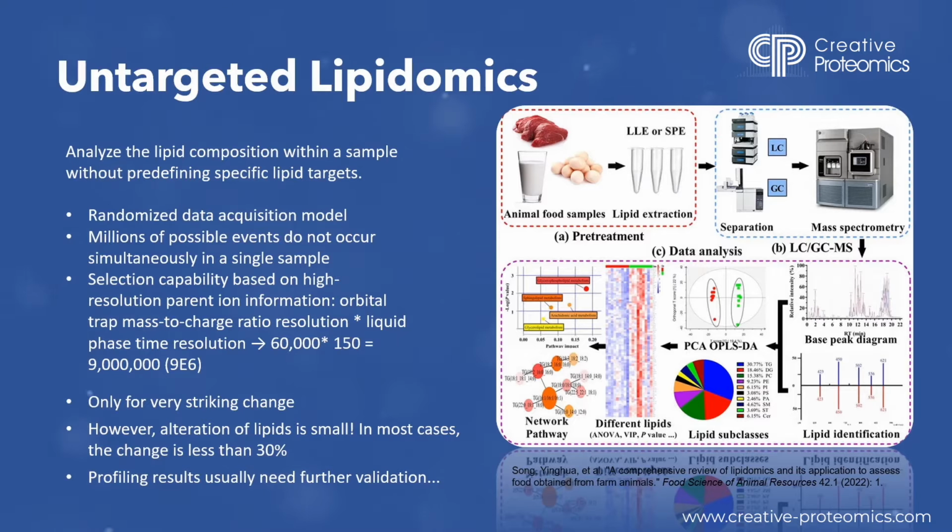Untargeted lipidomics analysis is particularly useful in discovering novel lipid biomarkers, identifying lipid profiles associated with diseases or treatments, and elucidating lipid metabolism pathways. It provides a holistic view of lipidomic changes in a system and can uncover unexpected relationships and correlations. Unlike GC-MS, which is primarily limited to volatile compounds, LC-MS can analyze a much broader range of lipids, including polar lipids, phospholipids, and sphingolipids, which are not amenable to GC analysis.